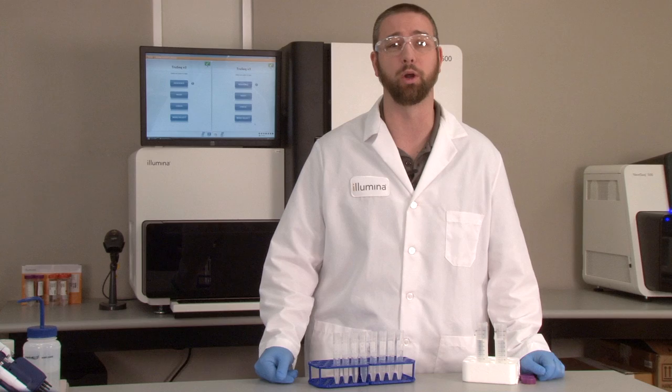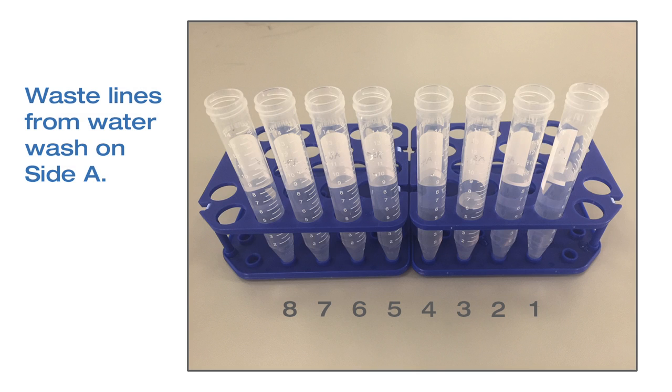To illustrate this point, on the right are eight tubes that captured the waste from a water wash on side A. One tube, which was collecting waste from lane number three, is significantly lower than the other seven tubes, and would clearly indicate poor flow.